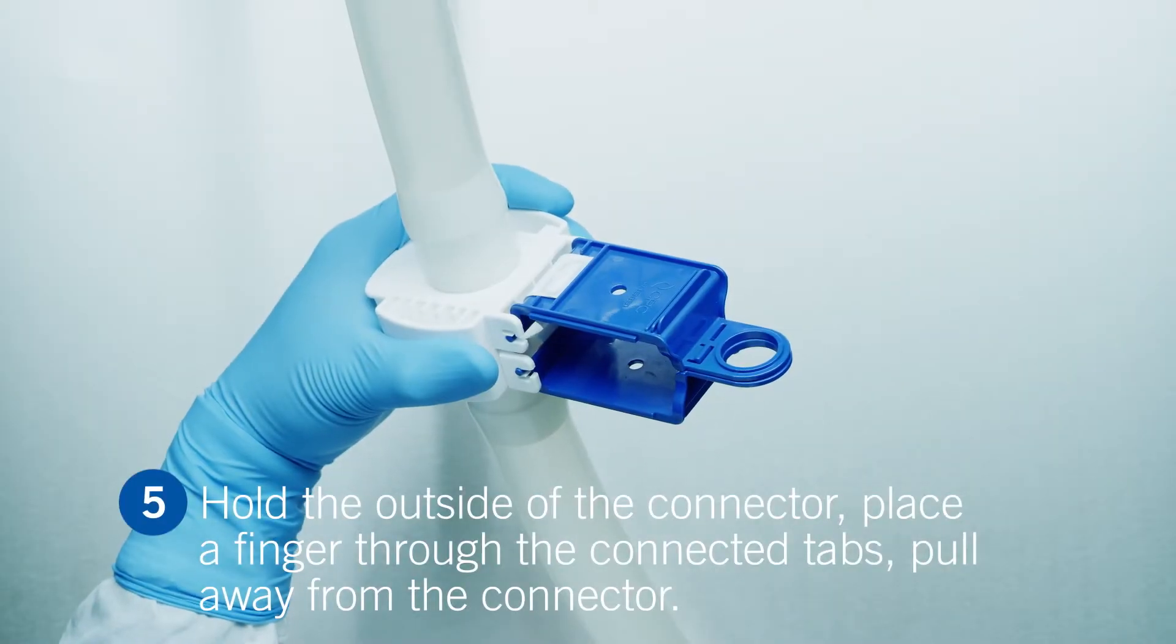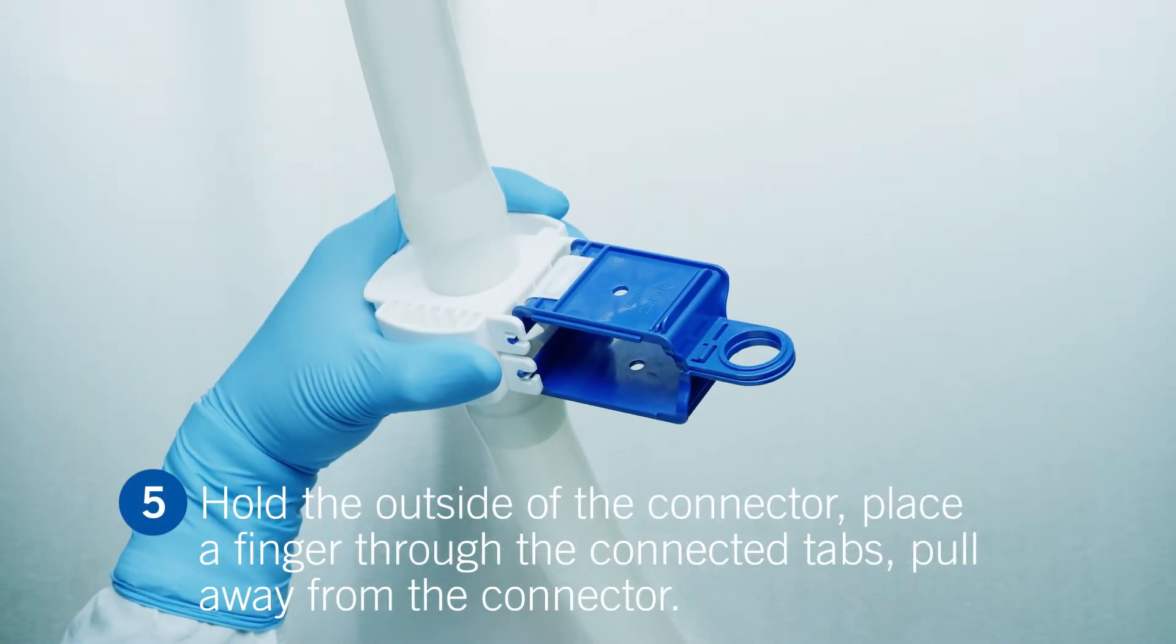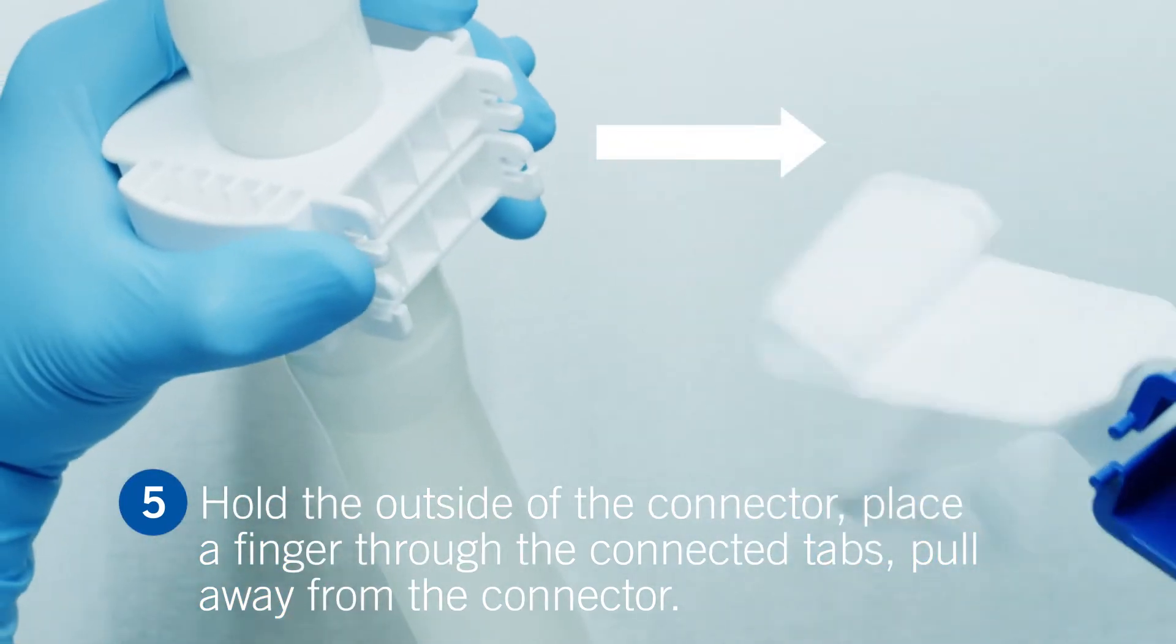To remove the membranes, hold the outside of the connector and place a finger into the connected tabs and pull directly away from the connector.